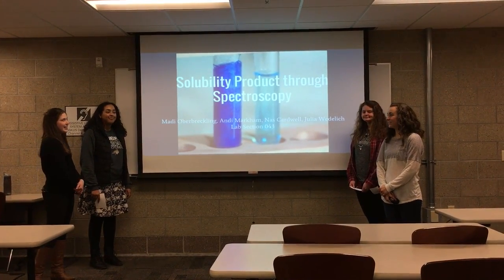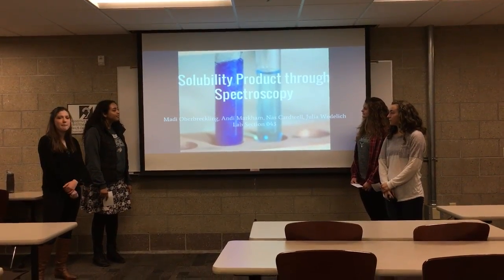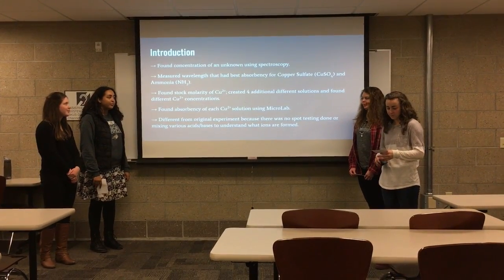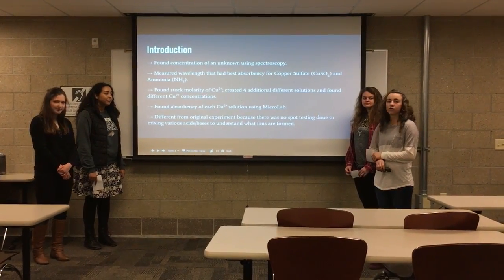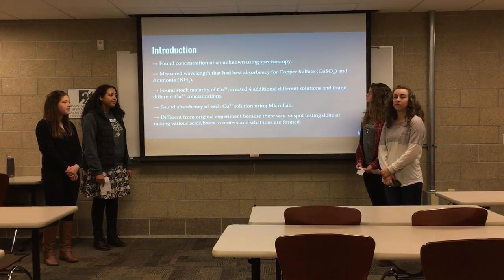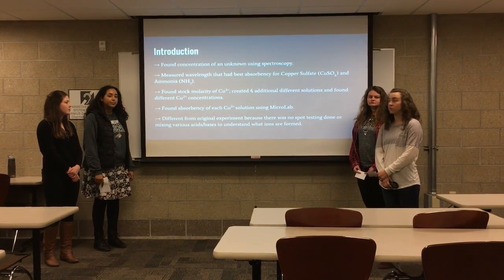I'm Maddie. And our extension project was on the solubility product through spectroscopy. So in this extension, we found the concentration of an unknown using spectroscopy, and we measured the wavelength that had the best absorbency for copper sulfate and ammonia, and we also found the stock molarity of the Cu2+, and we created 4 additional solutions and found the molarity of those as well.